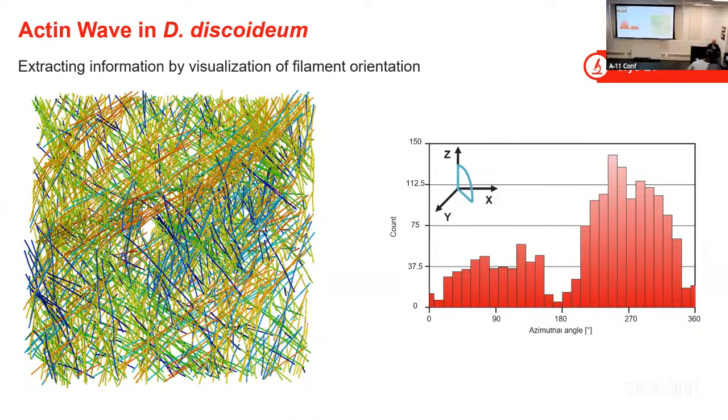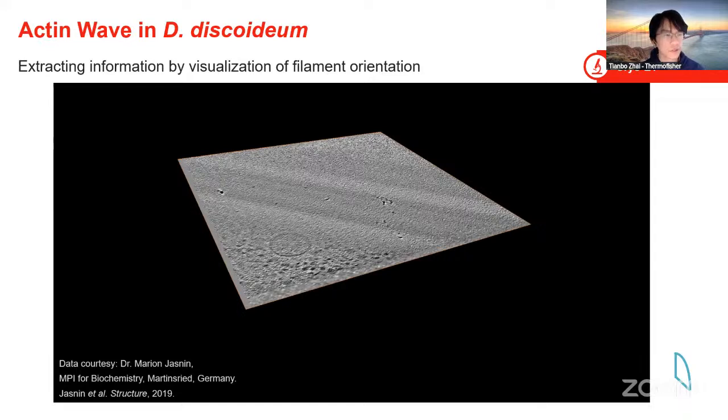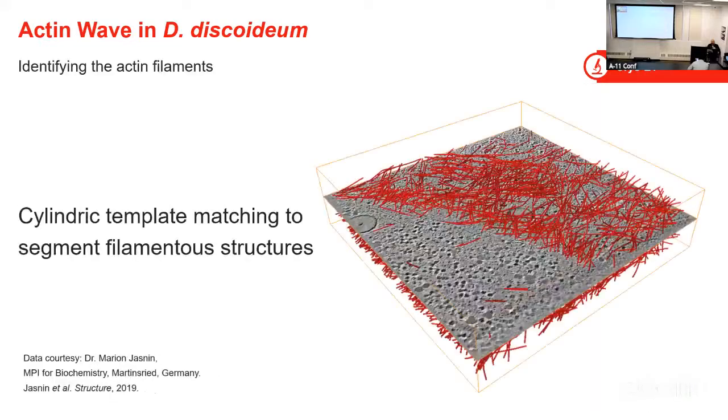Yes, and when I tried to input the dimensions of the tube into AMIRA to auto segment, it wouldn't let them in. It said it was too big, and I was just wondering, does that mean there's a size limitation to the tube segmentation feature? Size limitation for what segmentation feature? The auto tube detection segmentation. Were you referring to the cylindrical correlation, that module in particular? Yes, that one. Oh, okay.